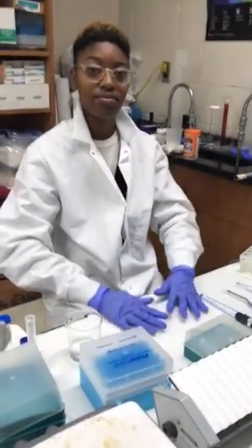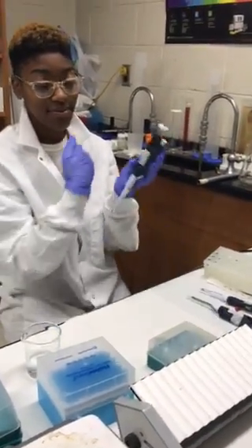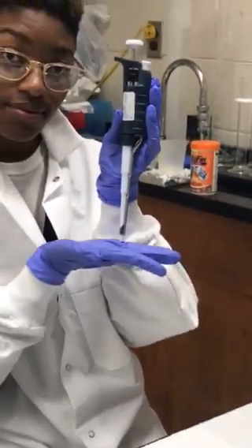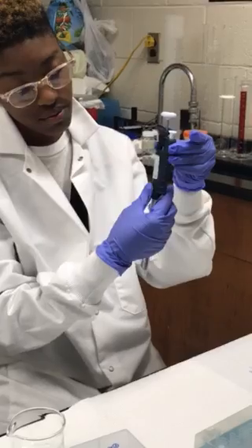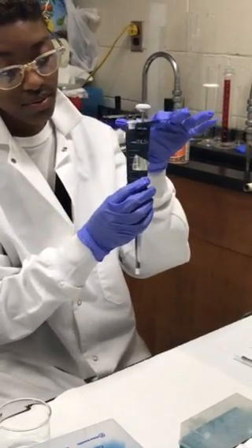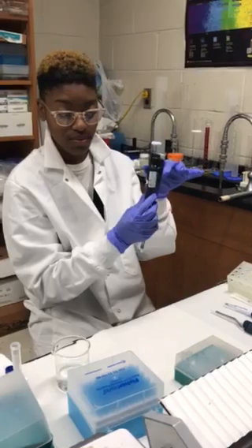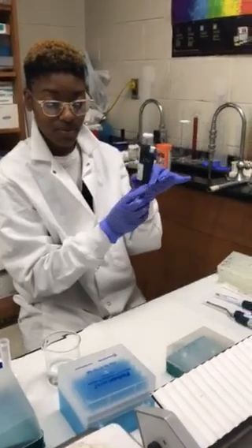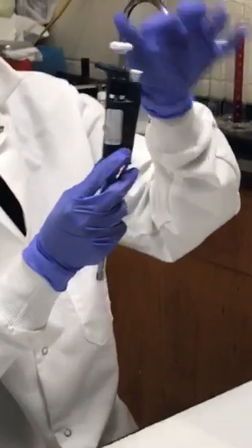In this video, we will be demonstrating how to use a Gilson micropipette. A Gilson pipette is an instrument used to measure liquid substances. It measures the units in microliters. Every 1 milliliter equals 1,000 microliters. To change the volume, there is a volume adjuster ring located in the middle gap of the pipette.